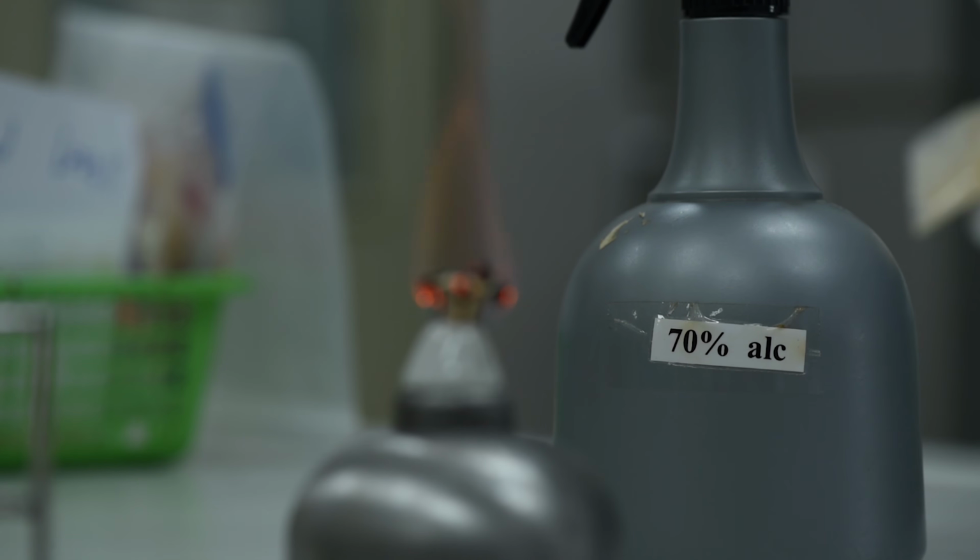Again, you have to use the compound microscope to observe the bacterial shape in this exercise. If you don't remember how to use microscope correctly, please go back to Laboratory 1 to watch the video, and it's going to help you to observe the bacteria in this laboratory. In the exercise, you have to prepare the clean slide and smear with bacterial sample.